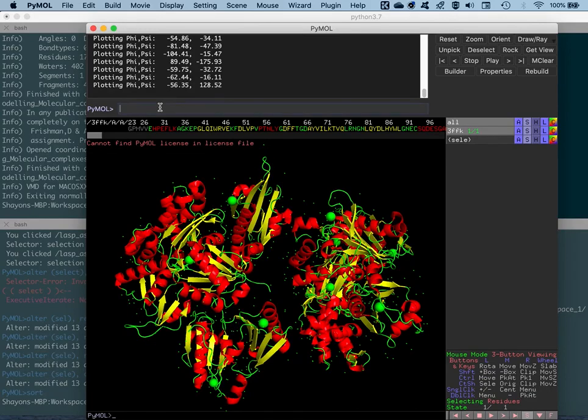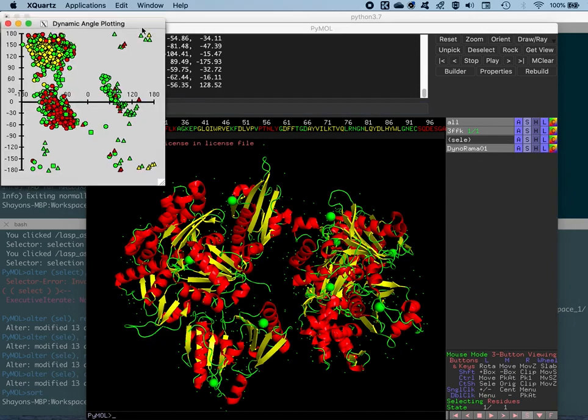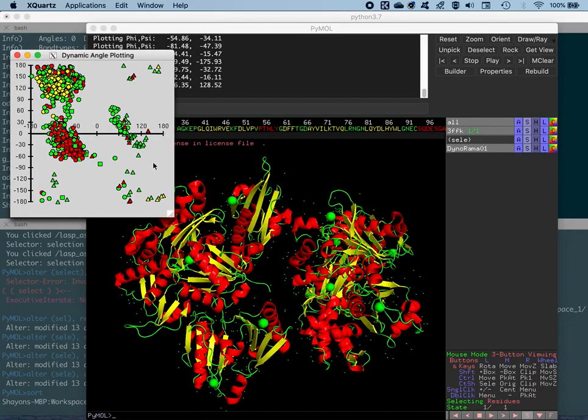So we'll do the same again, generate another Ramachandran plot. So type in Rama all and press enter. There you go. You have all the coloring according to their secondary structures and the designated residue position. So the triangle again stands for the glycine. And as you can figure out, most of the glycines out here are loop regions because they are colored all in green. And some of the glycines belong to the helical region. These are like an exceptional case. And then you have one of the glycines that's actually beta sheet. Most of the rest of them are all in the loop region that's colored in green.